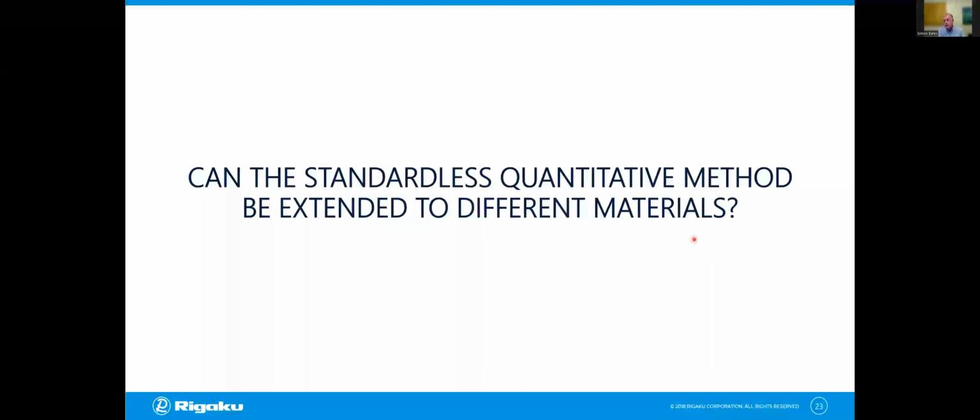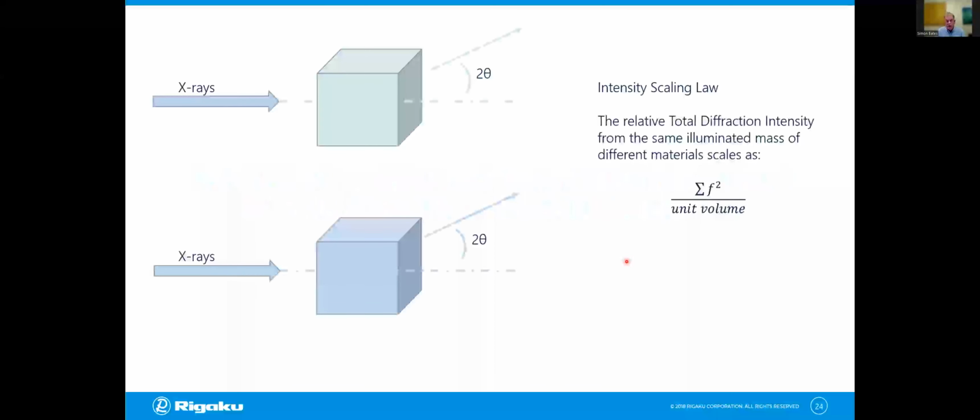Your reference materials might not be representative of what actually comes out of your production process itself. So the preferred approach is to work with the production materials themselves, and then use MCR component analysis to pull out the reference components before going into the total pattern fitting, total diffraction analysis, and working out the quantitative values.